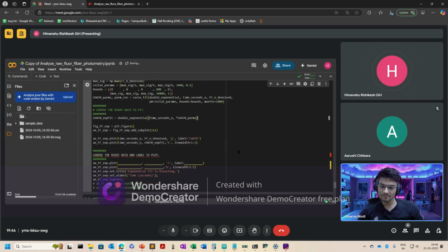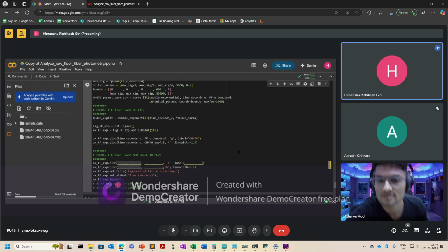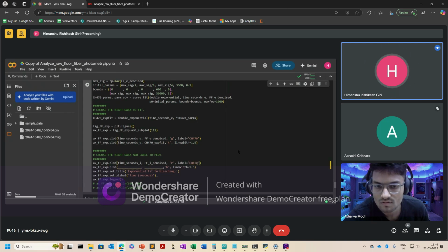Choose the right data to plot. Fit, CH 410.